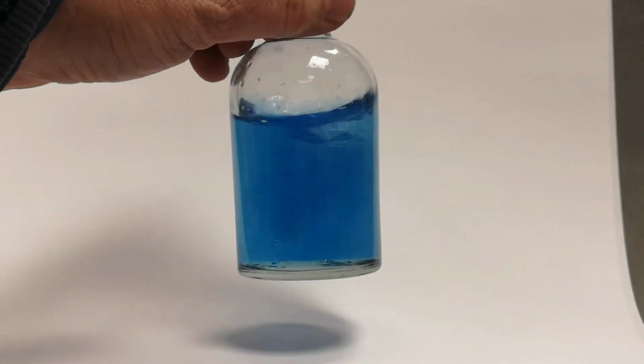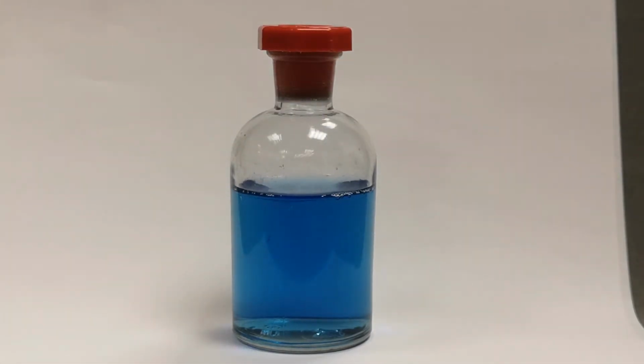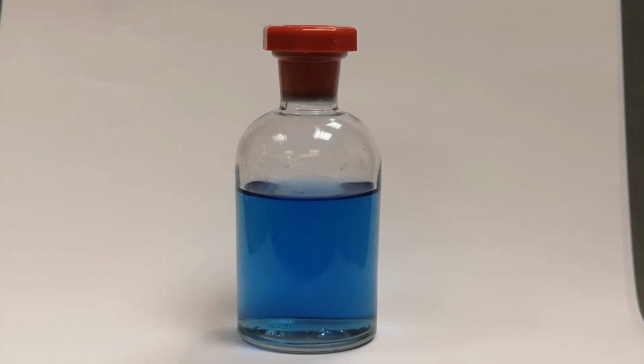You can show this with an entertaining demonstration called the blue bottle. Glucose is dissolved in dilute sodium hydroxide in a bottle or flask with a lid, and a small amount of methylene blue is added. Once mixed, if you leave the bottle alone, it will soon go colourless. The alkaline glucose acts as a reducing agent and reduces the methylene blue to the colourless form.